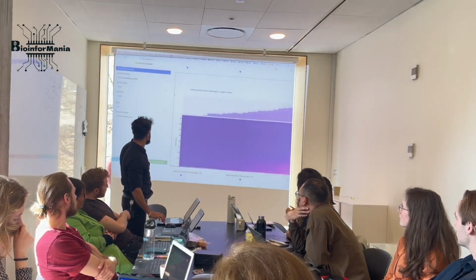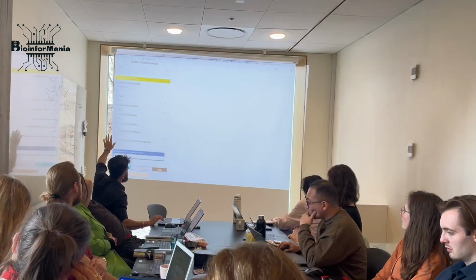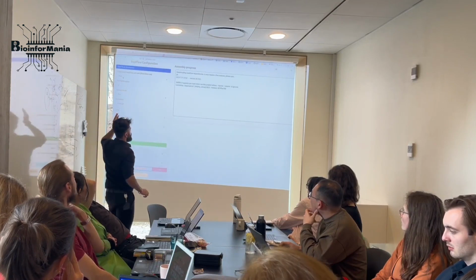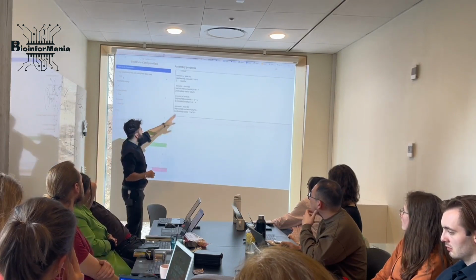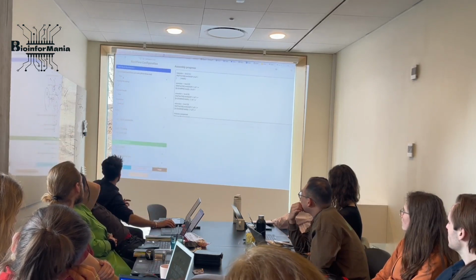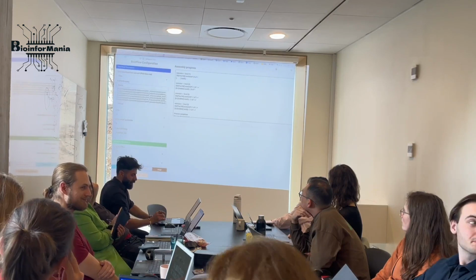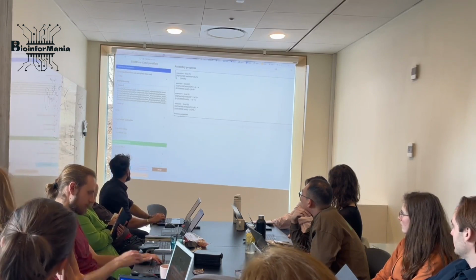And then we continue our next step analysis with this folder, okay? Let's run BactFlow. The first option here is true, okay? So it's checking whether BactFlow has been installed in my Conda environment or not. If it's installed, finish it, that's it. Don't do more. But I want to do assembly right now. What I do, I set this to false, and then I give the absolute path to my assembly, okay? Which is home. This time I'm giving it my own home directory because this is my sudo docker with root permission, so it has access to it.